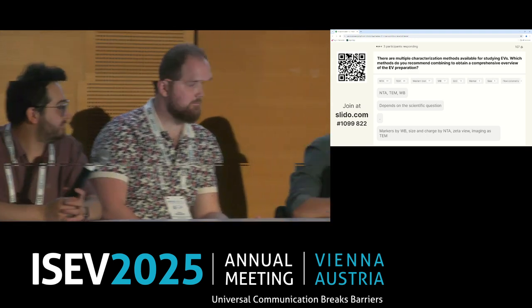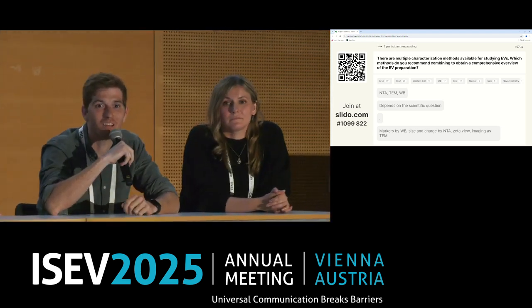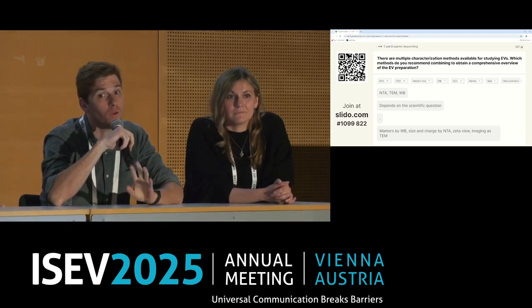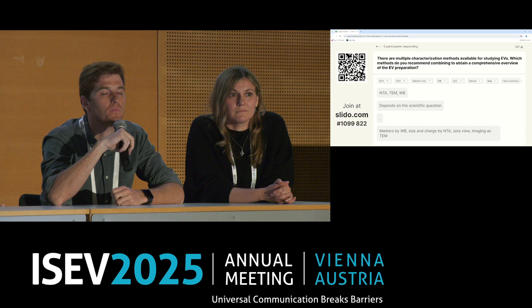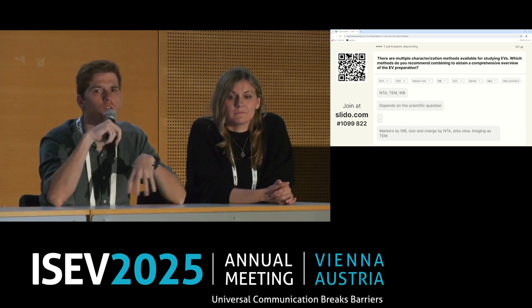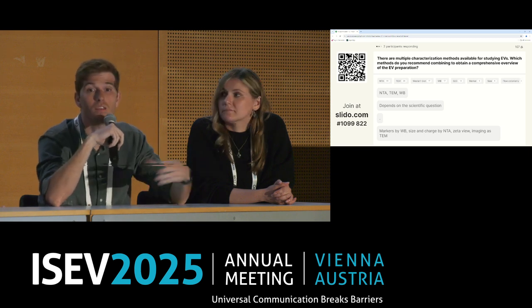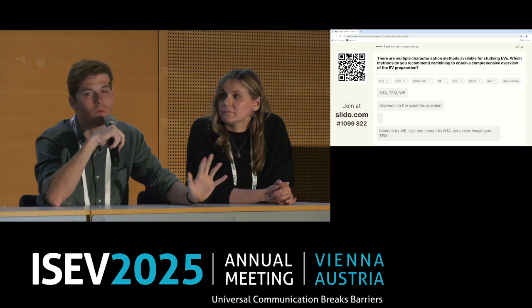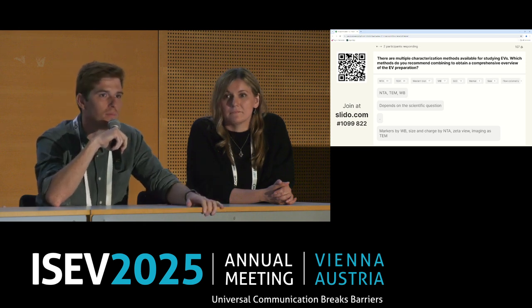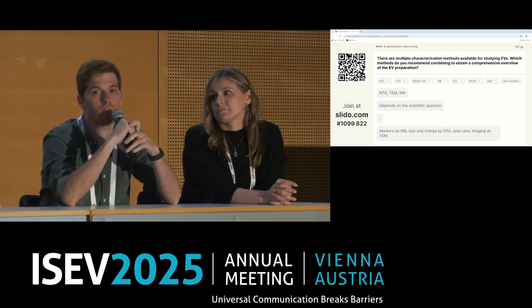I just want to say that controls help with that a lot. I don't want to sound like a control freak, but kind of. I also want to say that it never happened to me, but all the time. And it's very, very scary, especially as a newcomer, because you have a lot of expectations when you do a Western blot, and you're supposed to find the EV markers, but at the end of the day, you spend two days on something, and then you have an absolute blank slate. Techniques have their limitations. It's also quite hands-on a lot of the time. That's what I experienced as well.